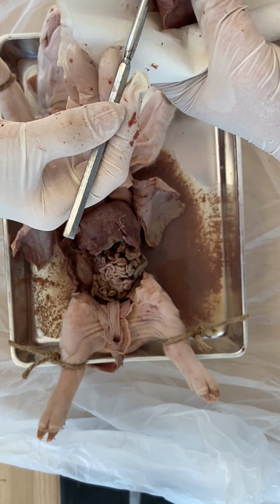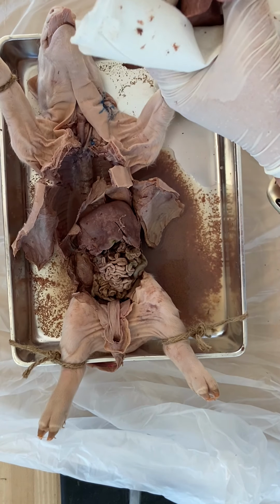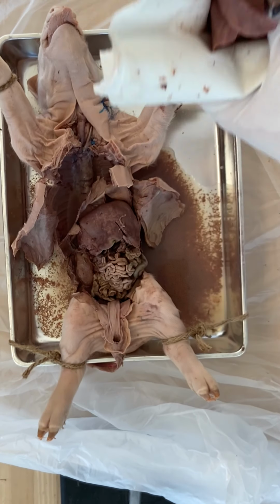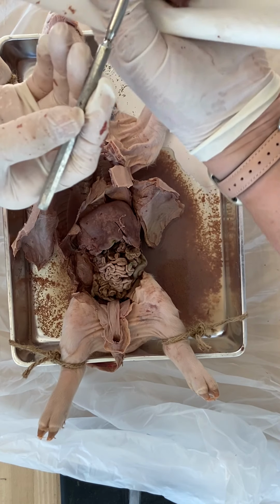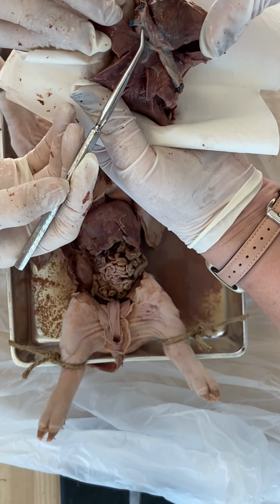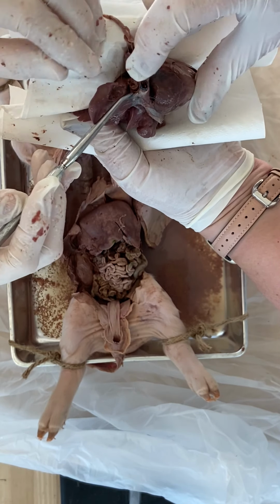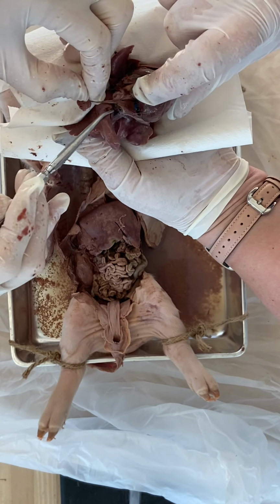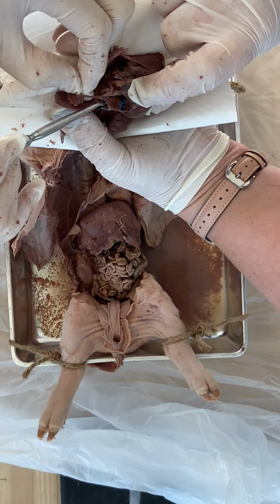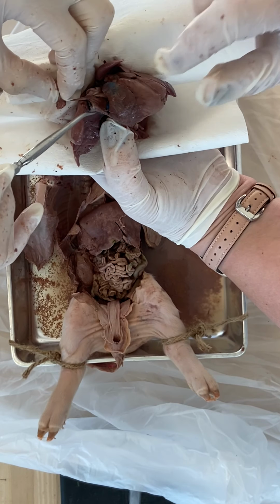Let's see, yeah. That's just tissue. It is just tissue, connective tissue. A lot of things just holding everything together. Oh, there we go. So we can see the inferior vena cava coming up into the right atrium, and here is the superior. There it is. You can see it going down there. Superior vena cava going down into the right atrium.